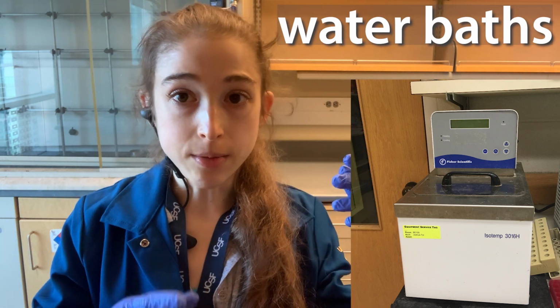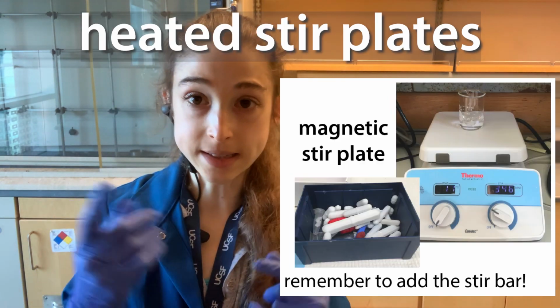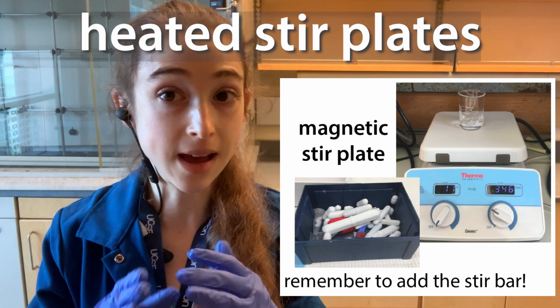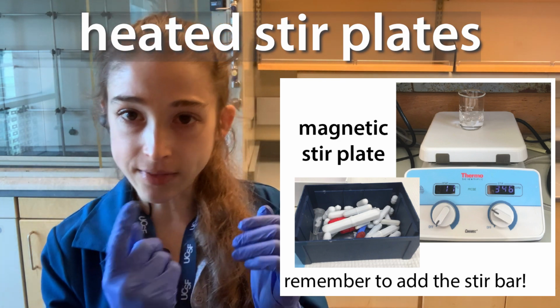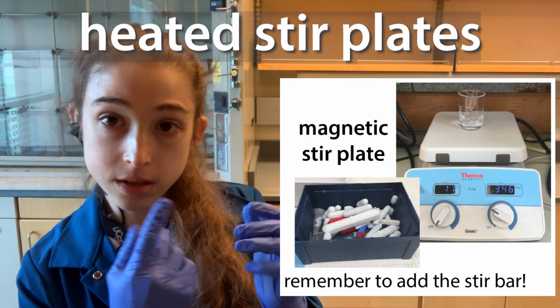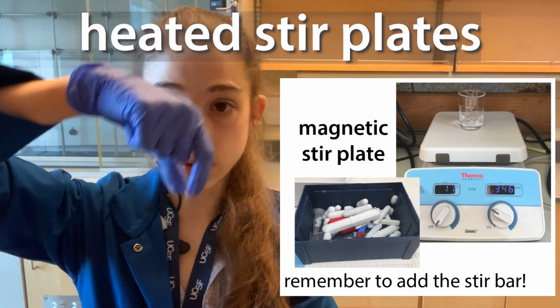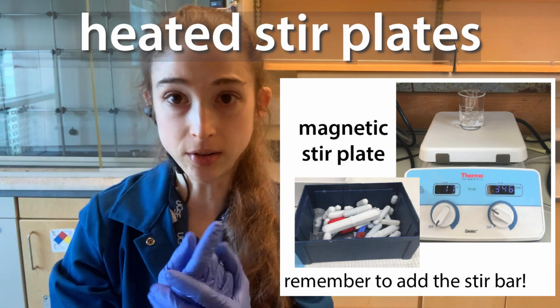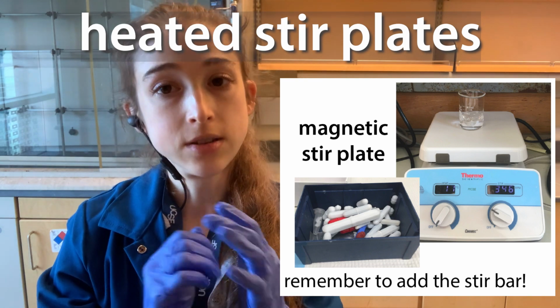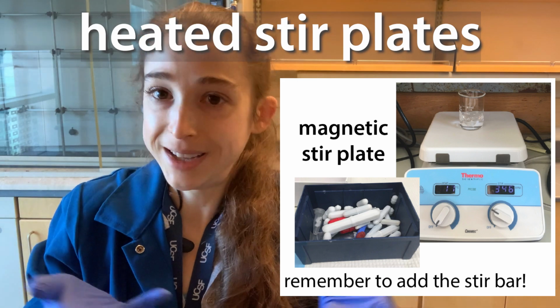So now we've talked about baths and tubes and all this stuff. Let's move on to heated plates. These magnetic stir plates sometimes have heaters too. Basically these stir plates have a magnet underneath that spins, or inside, whatever, under the plate. Then you put a stir bar into your sample, and you turn the spin on and it spins, and then you mix up your liquid. Really, really helpful. Sometimes these have a heater too, and then they'll heat your samples.